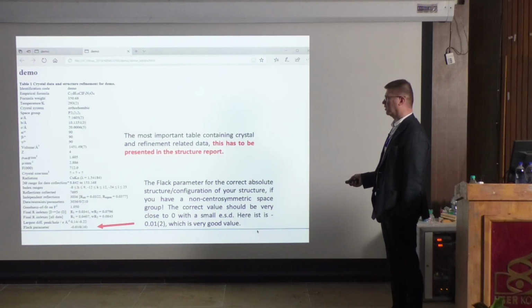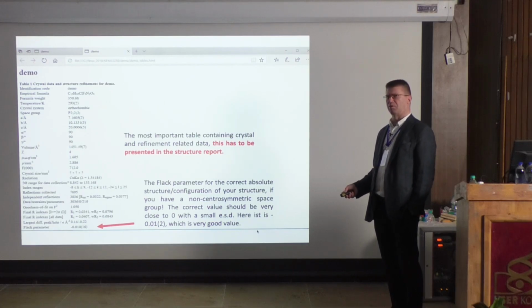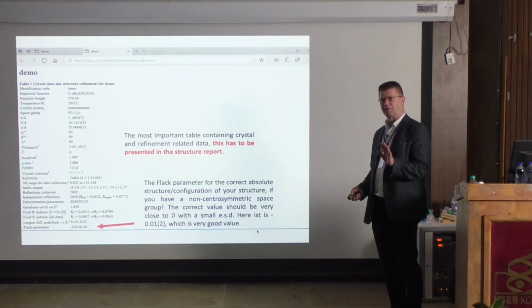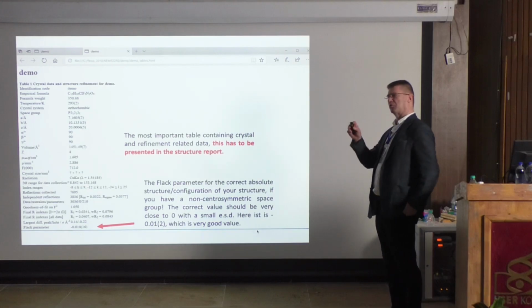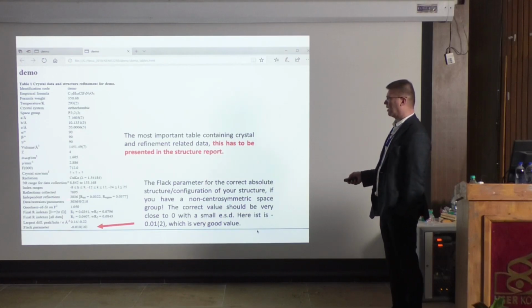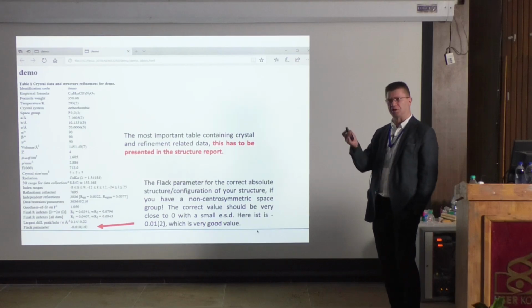And this is how many reflections it has collected. And this is quite a lot. Remember when we saw a few of them, but it's 7,695. And now they have been measured several times, the same thing. Remember there is 002 and 002. It measures 2 times. So when you take an average and look for independent reflections, it's about 1/2 of that. So that is the real number of reflections we are using for our structure. So it's more than 3,000 pieces of information we have to have in order to get the structure.